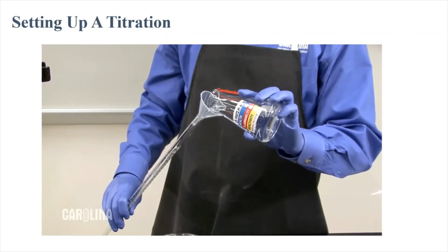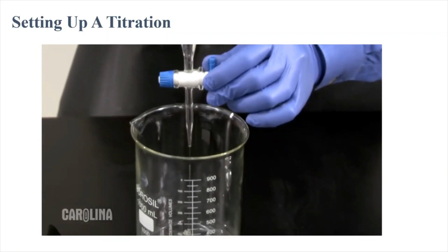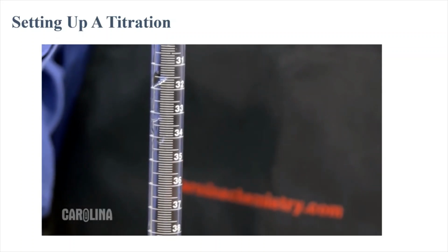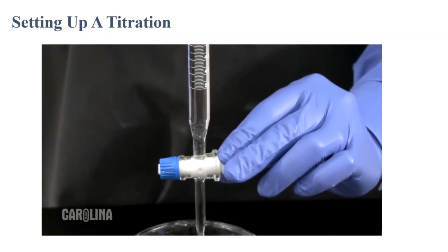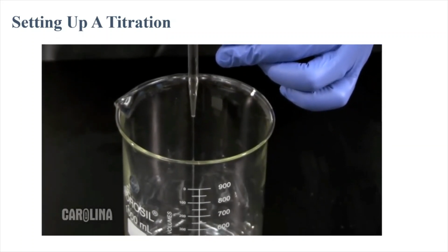After each rinse, open the stopcock to allow the liquid to drain out the bottom. If there is a lot of liquid clinging to the walls of the burette, then thoroughly clean your burette and repeat the rinse process. The accuracy of this technique is dependent on the titrant flowing into the flask and not sticking to the walls of the burette.